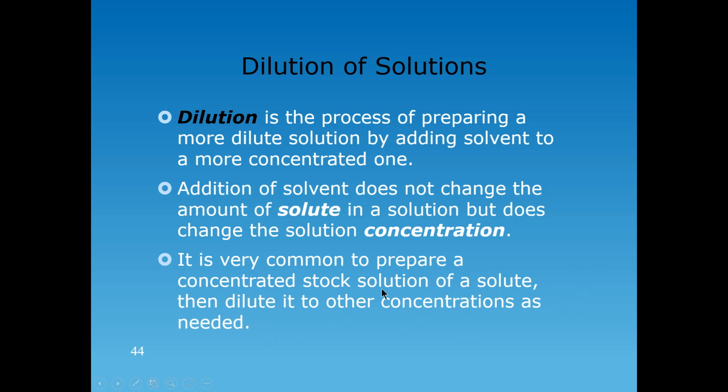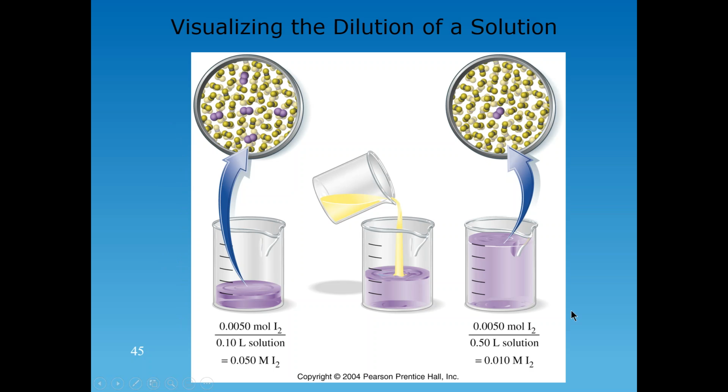So as stated here, it is very common practice in the labs that if an experiment requires a more dilute solution, then what we would do is dilute a more concentrated solution. So very often we prepare a concentrated solution and then dilute it as needed based on whatever experiments we're trying to carry out, all right?